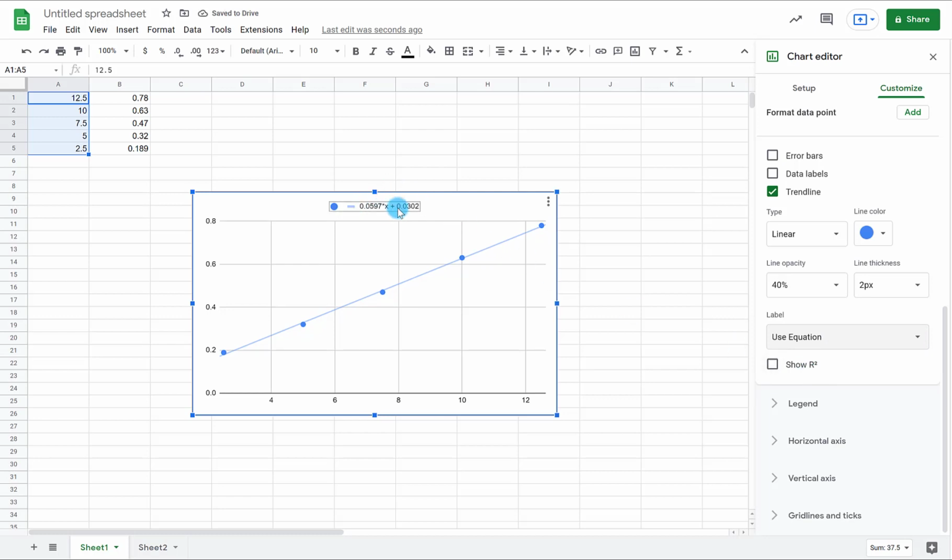So we need this slope value, the shift value. You could put R squared. This will help in the error analysis later. For this set of data, it looks pretty clean. This one's a little off, but we need this equation right here. So for whatever these values are, we can solve for what x is going to be.